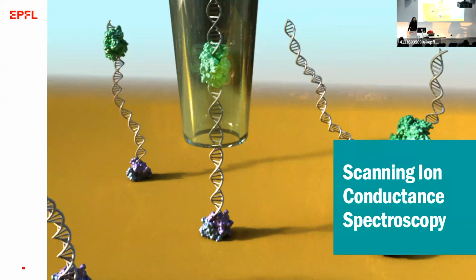and having neighbors who work on scanning ion conductance microscopy using pipettes that are in fact nanopores, really gave me the idea to think about why we are maybe wasting time combining everything with the optical tweezers. Maybe we should really do straight deposition of the molecules on the surfaces and exploit this nice technique and the way that we have progressed technologically in terms of not only instrumentation, but also probe development.